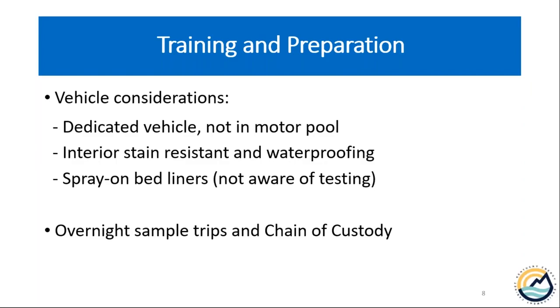We also like to think about overnight sampling trips. Of course, your chain of custody is the same for these samples as any other, but as much as possible, we try to avoid holding these samples overnight.